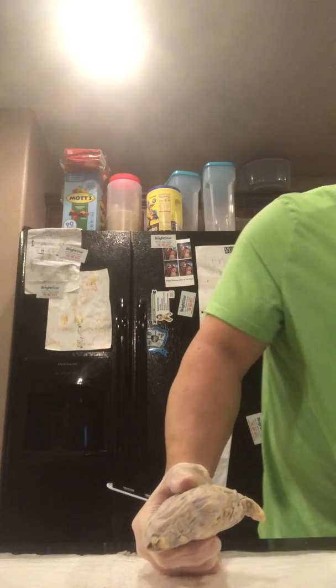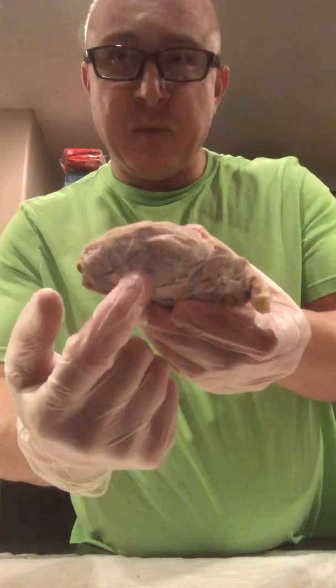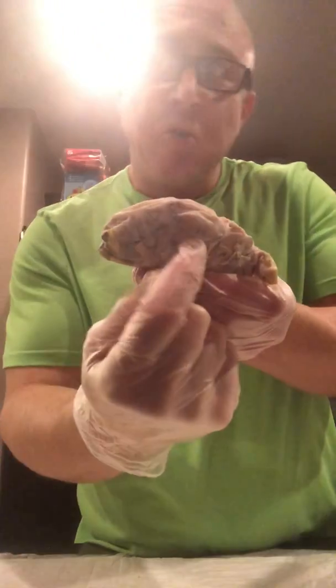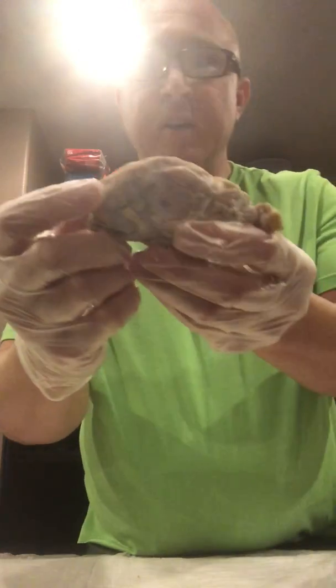Let's see, mid-sagittal section, the corpus callosum is going to be in the center here. It's a little kind of half circle, half moon. The thalamus is going to be about down here. The hypothalamus is going to be just below the thalamus.